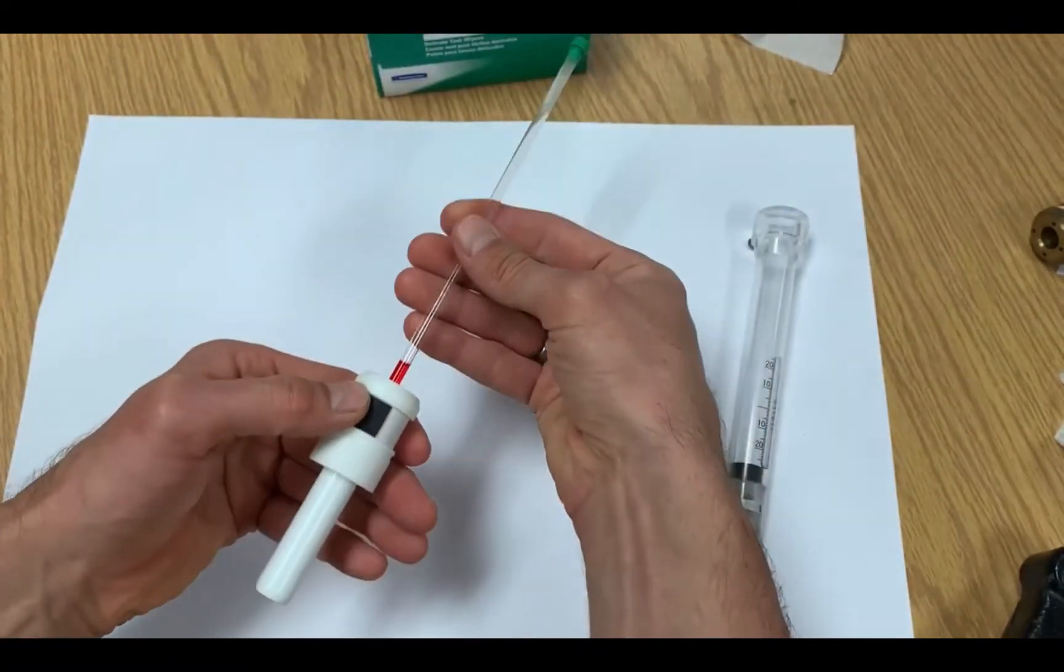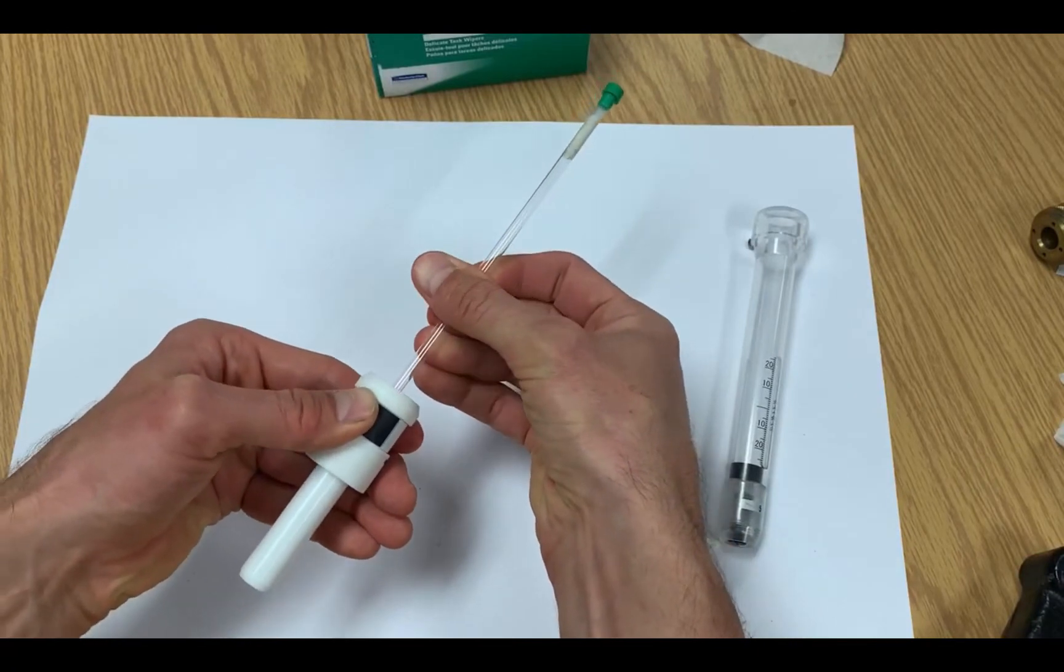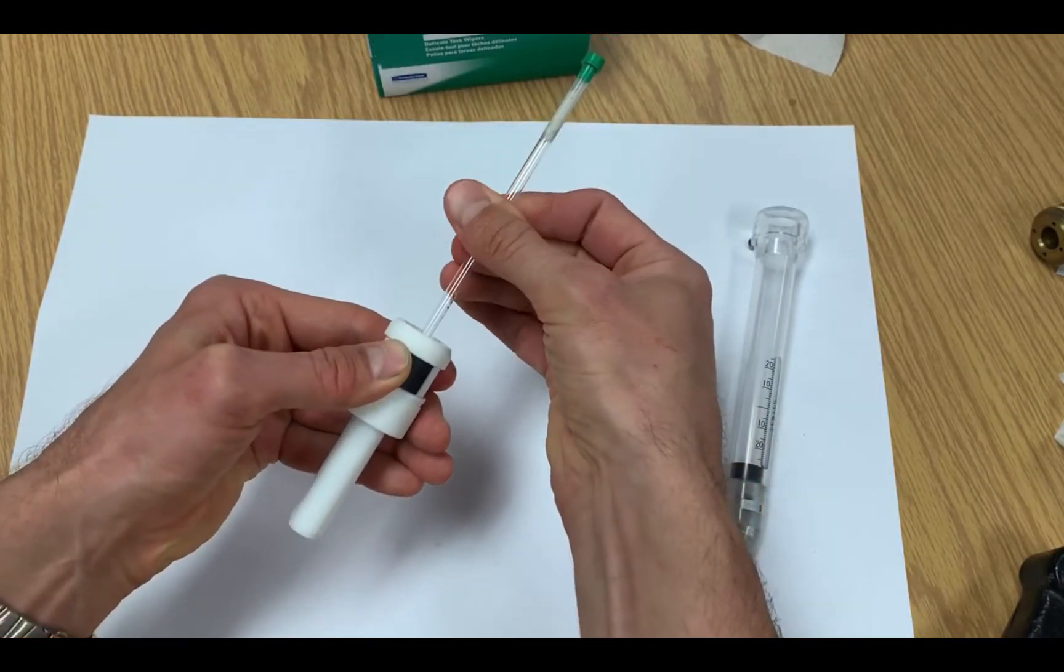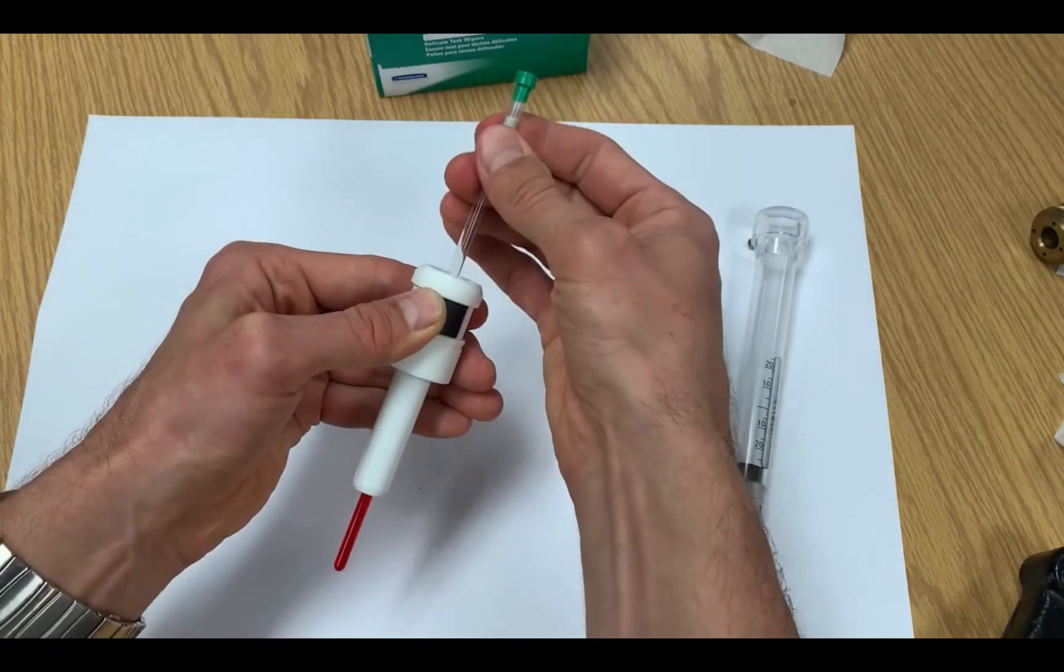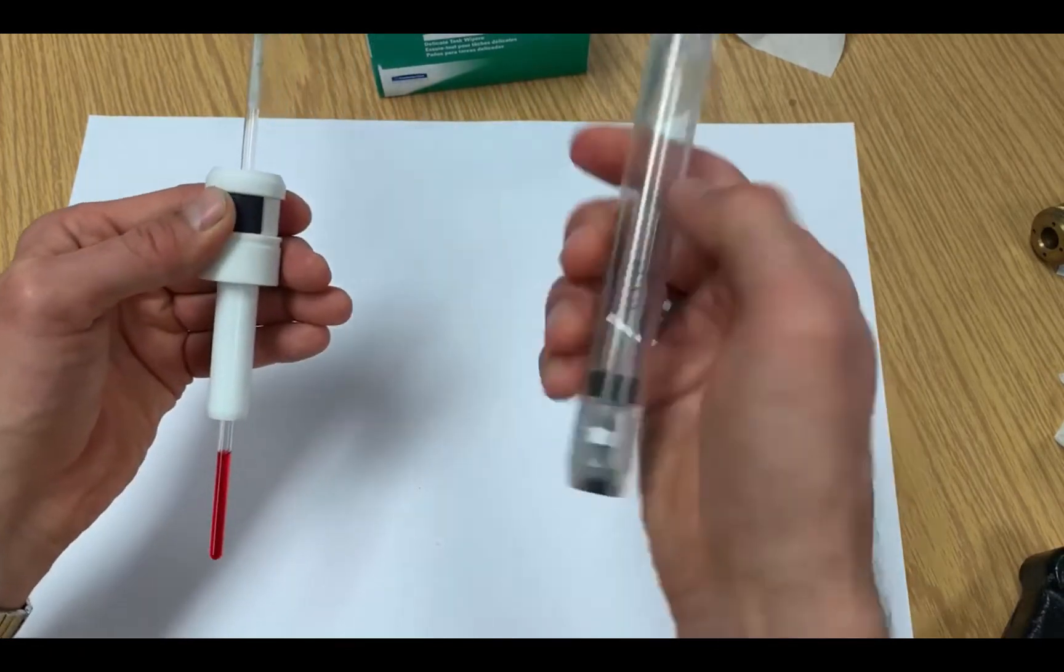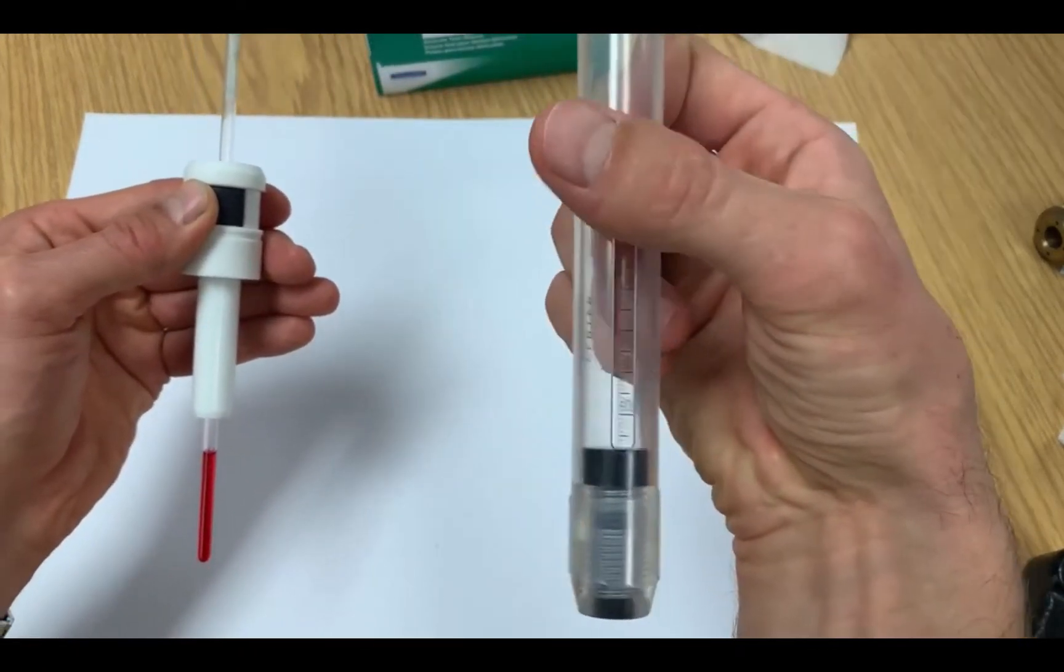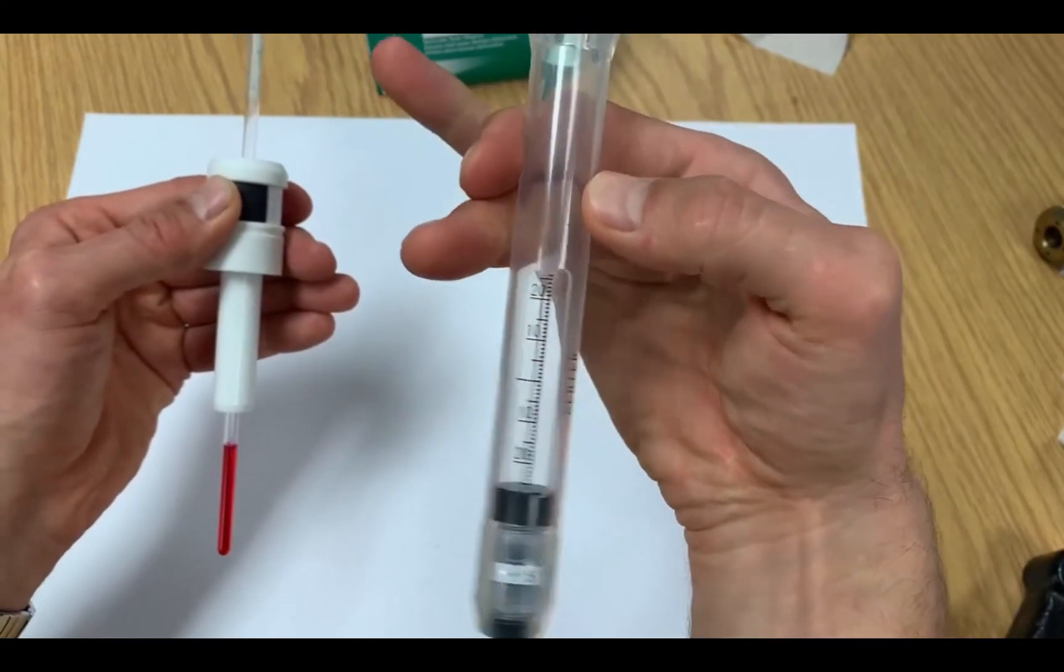When inserting the tube into the sample holder, use even pressure and rotate the tube as you push down, as my colleague is demonstrating here. This will overcome any friction between the tube and the O-ring inside the insert.